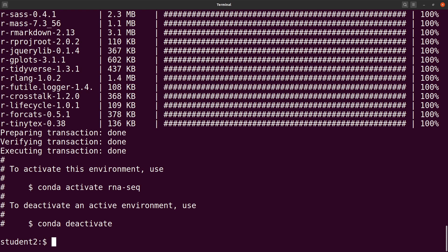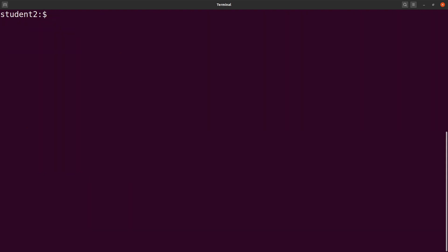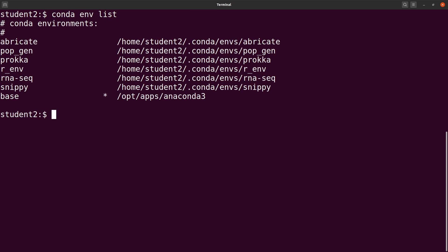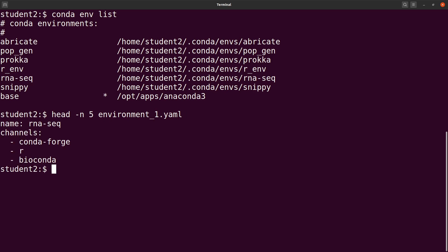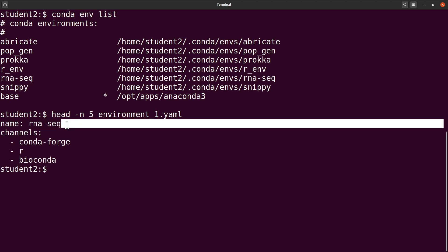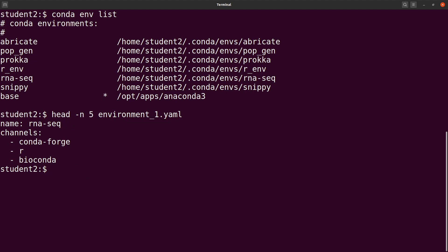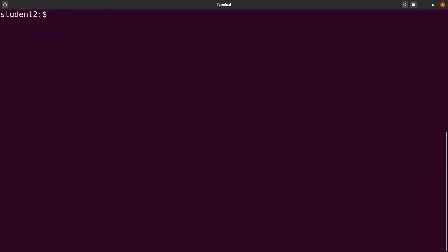Installation is complete. Let's clear the screen and continue. The next thing we have to do is to activate our environment. To activate, you need to call conda and specify the environment name. If you don't know the environment name, you can check by saying conda env list — this will show the environments on your system. Our environment is called RNAseq. You can also confirm it by doing a head on the environment file. So let's say conda activate RNAseq. We now have the environment activated.